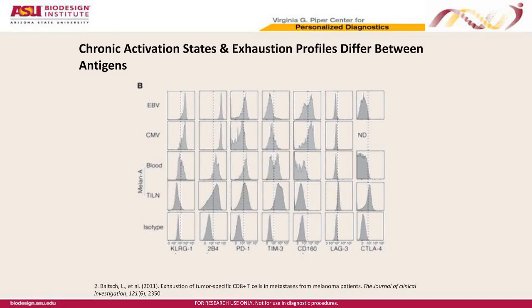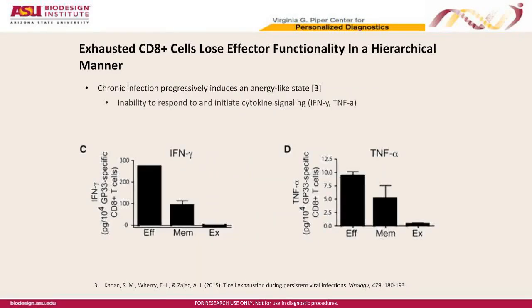antigen-specific T cells, in particular with CTLA-4 and also with TIM-3 and other biomarkers of exhaustion, and also biomarkers of activation. And so there is this difference and this need really to identify deeper profiling of the level of antigen-specific T cell exhaustion, and that it may vary between different sites within people as well as between different antigens.